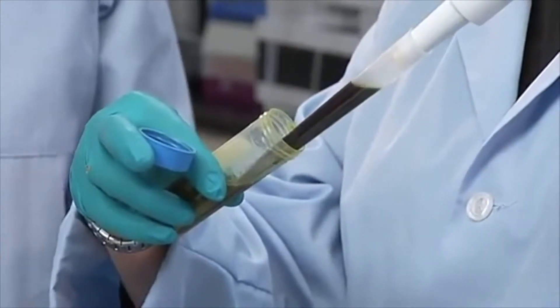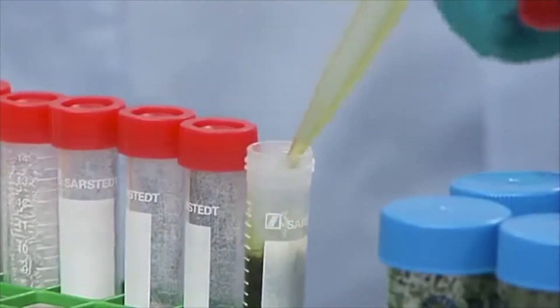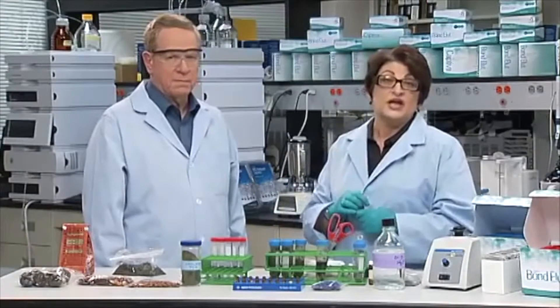The amount transferred will be based on the actual QuEChERS extraction methodology. Here we have used the AOAC extraction method, therefore we will transfer 8 milliliters of the acetonitrile layer to the dispersive SPE tube. The dispersive SPE will contain anhydrous magnesium sulfate as a drying agent and up to three possible dispersive SPE sorbents. Examples include primary secondary amine, also known as PSA, which absorbs organic acids from the matrix; C18, octadecylsilane, which absorbs fats and lipids; and graphitized carbon black, also known as GCB, which absorbs pigments like chlorophyll.